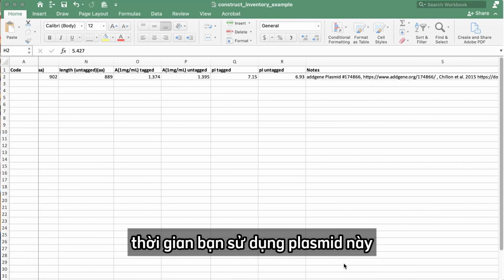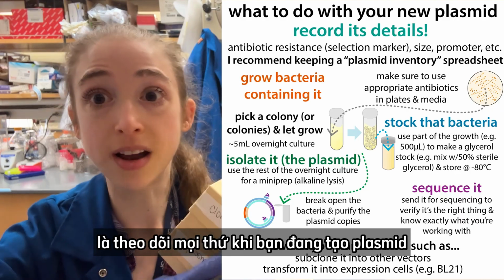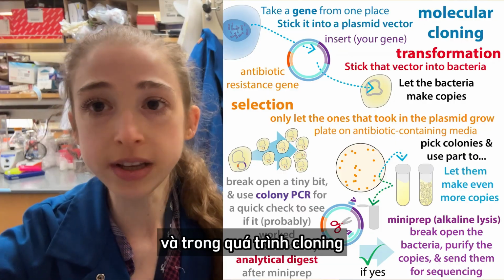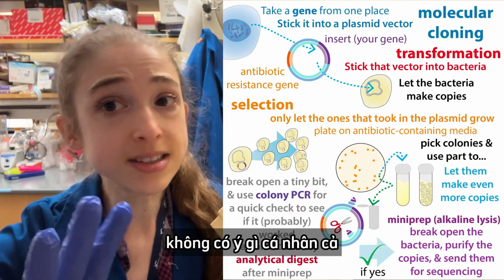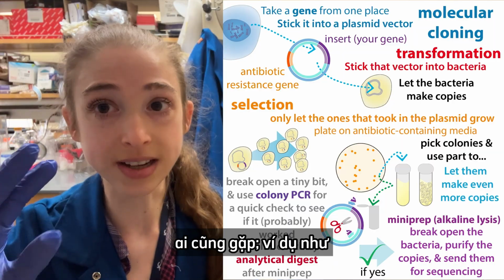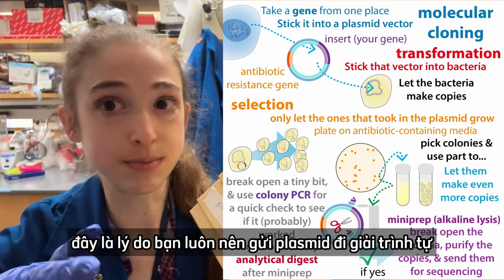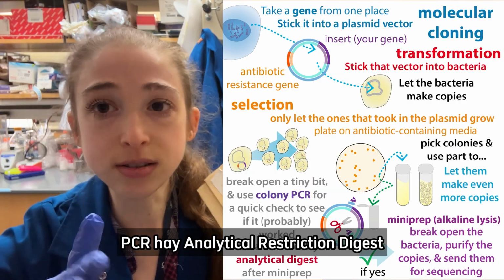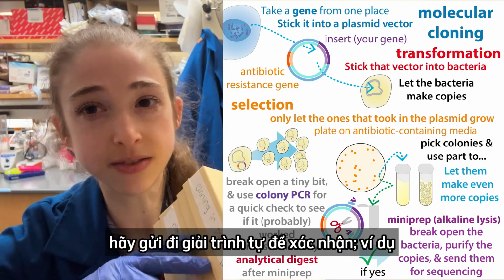So that's the plasmid inventory, and it's going to come in handy throughout the entire lifetime that you're using this plasmid. But what's also going to come in handy is keeping track of things when you're making the plasmid. In the course of cloning and mutagenesis and all this stuff, you're going to make a lot of duds. No offense, nothing personal, it happens to all of us. This is why you always want to send your plasmids for sequencing, even if you've done something like colony PCR or analytical restriction digest, so you think they're probably okay, send them for sequencing to verify.